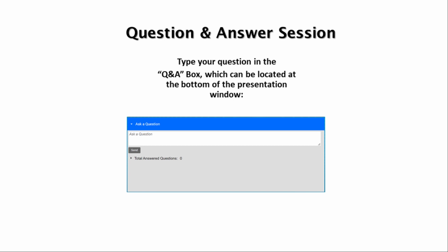Fantastic. Great info there. Next question from the audience. If I move a method which uses fully porous packings to superficially porous packings, can I just change the column or do adjustments need to be made? So it's likely that the flow rate could be increased when you move to a superficially porous particle column. And it's also possible that the injection volume could need to be reduced. So we actually have a method conversion guidebook on our website, halocolumns.com, that goes through the steps of switching a method from an FPP to an SPP column.